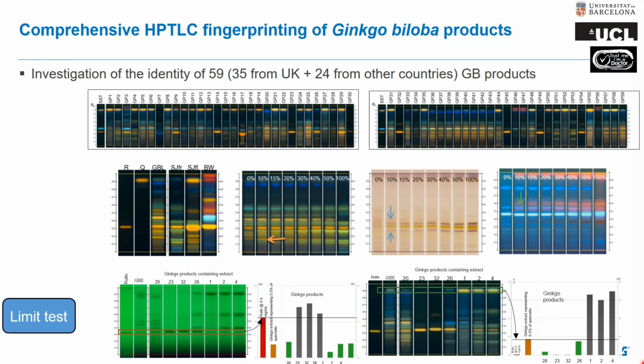However, the combination of HPLC assay and HPLC limit test and the limit tests performed by HPTLC in combination with identification have given the same results. So I would like to point out again, all those HPTLC results for each sample were obtained from one separation just by multiple detections on the same plate.